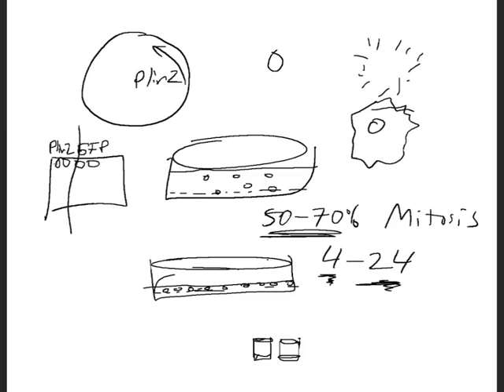So you'd have some cells that were transfected with the plasmid that had GFP, PLIN2, and the BLA gene. And then this one was the same plasmid, it just was missing the PLIN2. So this was our control GFP. So they both were going to glow, but the difference was what happens when these cells take on this plasmid, and they start expressing this transcription factor PLIN2.